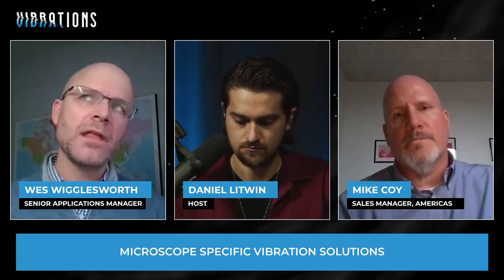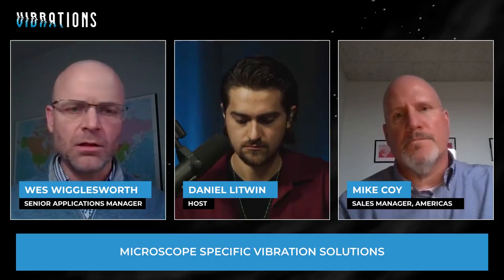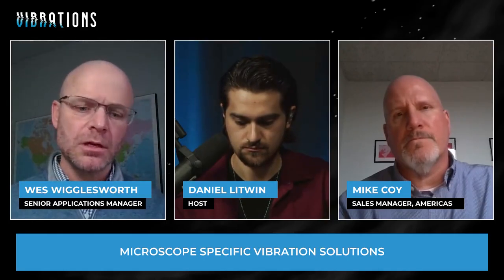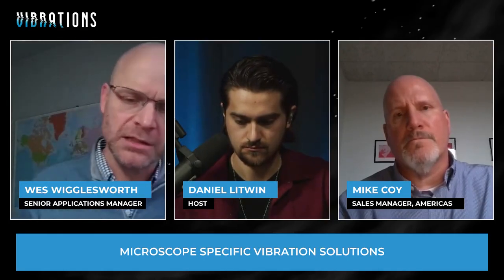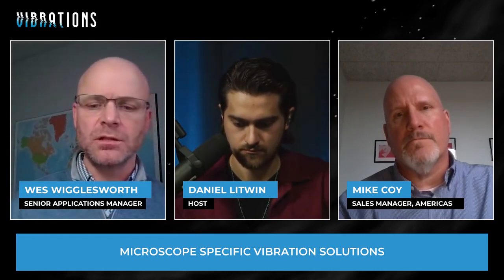So that's perfectly suitable for that type of device. And by the way, those light microscopes, just for our audience, those are things like cell culture research, some materials research, looking at electronic devices, but not really doing high magnification. So when you get into high magnification, and by that I mean not just a few thousand X, but 100,000X or a million X or million times magnification, things like electron microscopes.